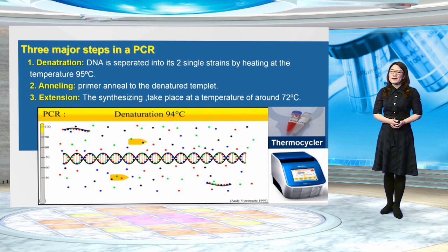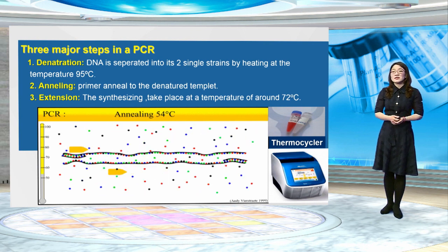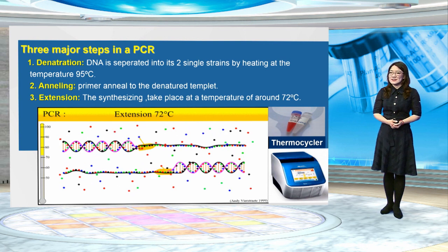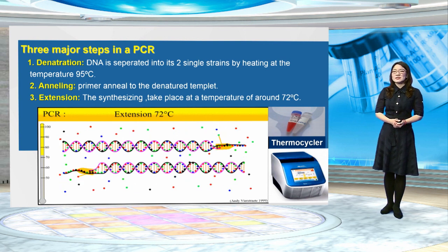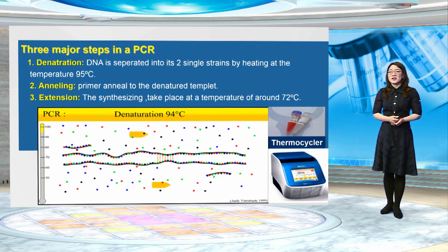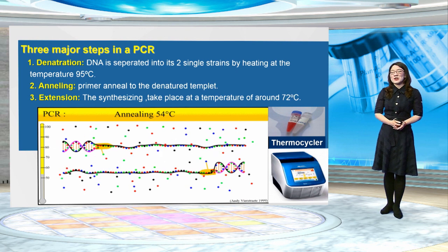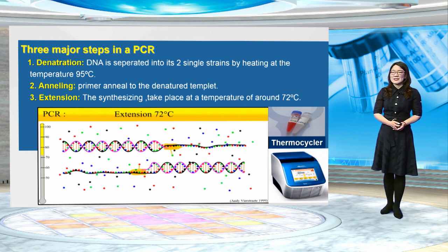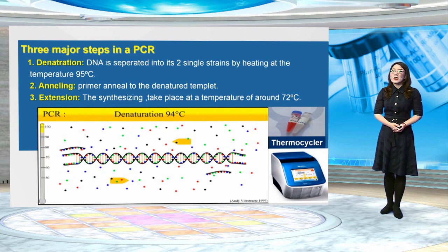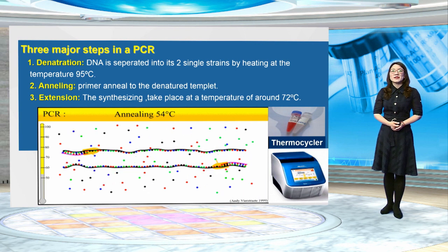The newly formed double-stranded DNA molecules are heat denatured again and can themselves serve as a template in a new cycle of DNA synthesis. During each step, the temperature and the duration of the reaction must be carefully controlled, which is most easily achieved by the use of automatic devices. One cycle will normally require only a few minutes, depending on the equipment used.